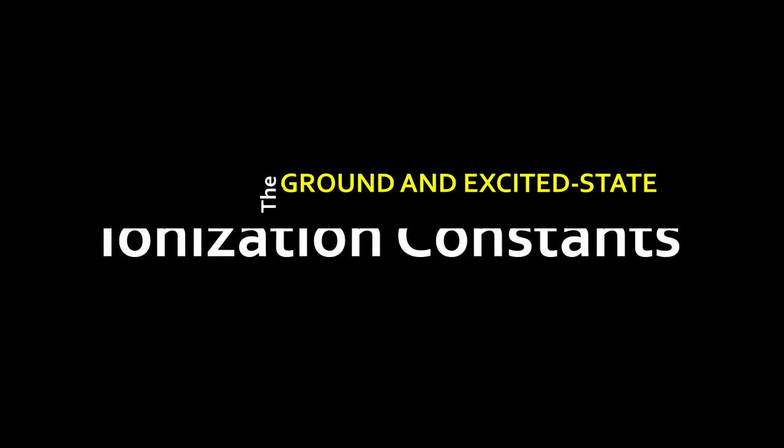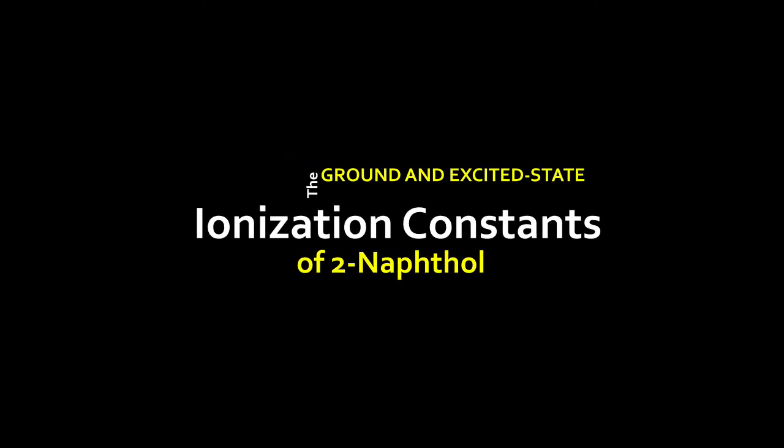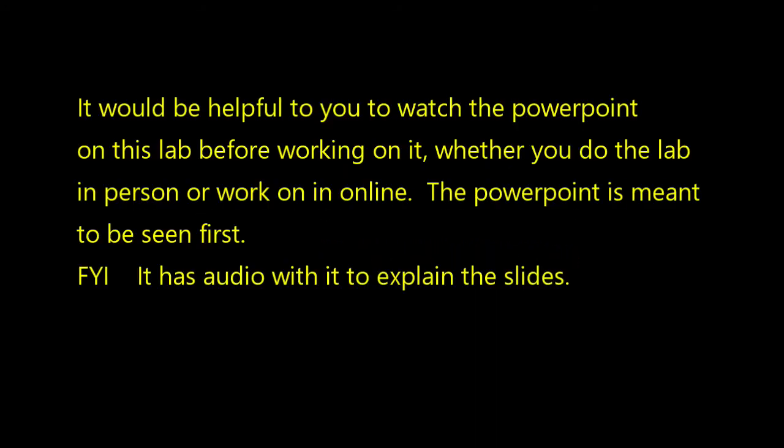This lab is on the ground and excited state ionization constants of 2-naphthol. I recommend that you watch the PowerPoint on this lab before working on it, whether you do it in person or online. Hi, so today we'll be doing the 2-naphthol lab.